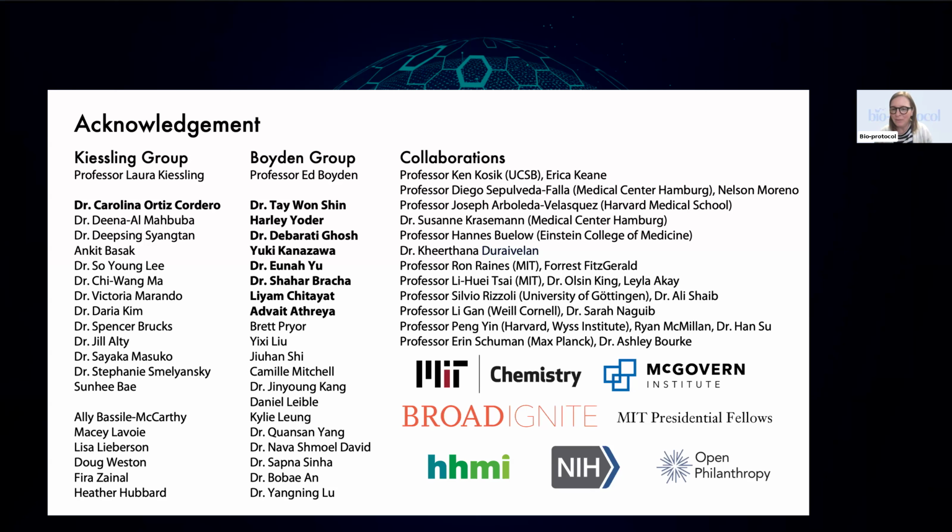Thank you. Valentine asks, have you evaluated different initiation methods such as thermal or photo initiations, and could those potentially alleviate a problem of sample equilibration with the gel prior to gelation? Yeah, so in the beginning we looked at different initiation methods, and then we ended up just choosing potassium persulfate because that's what most expansion labs are already using.